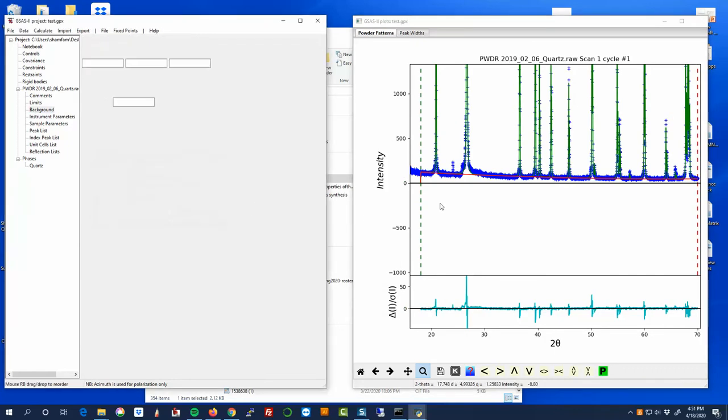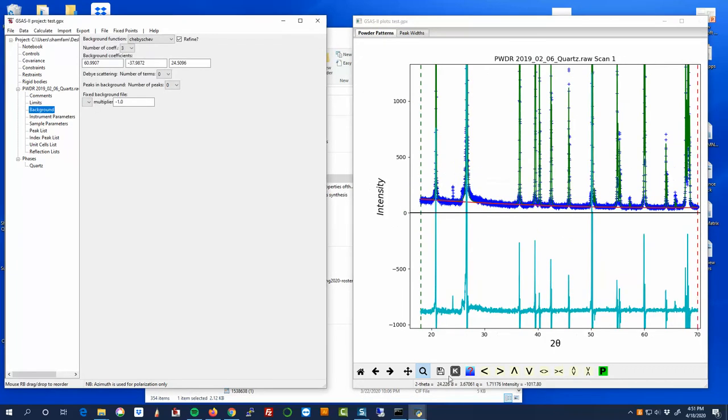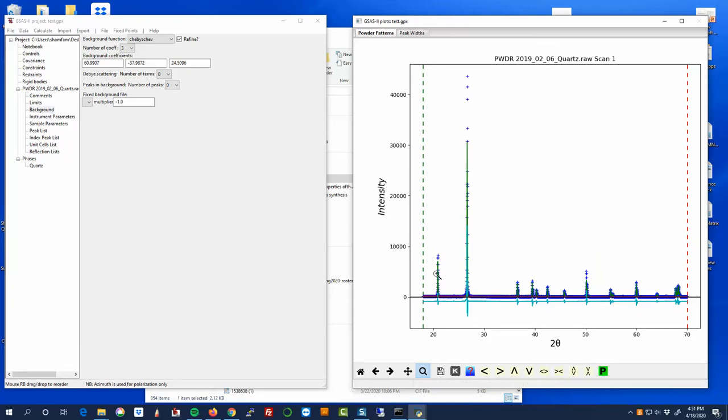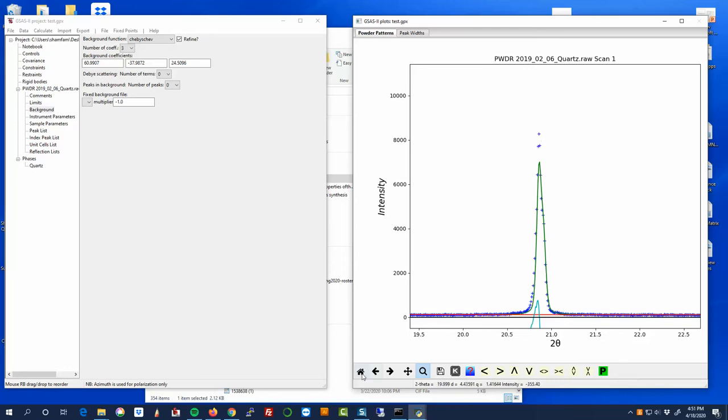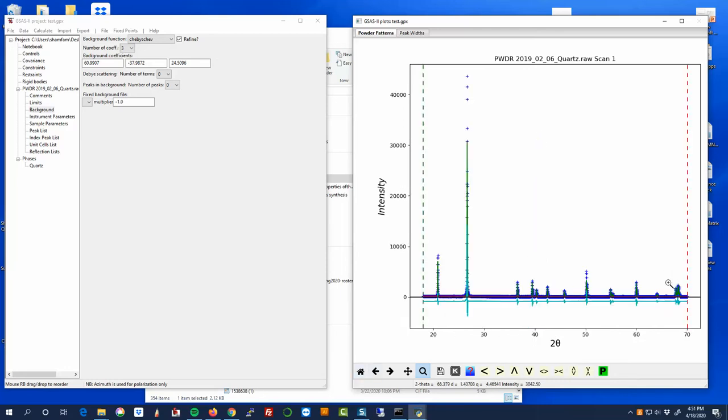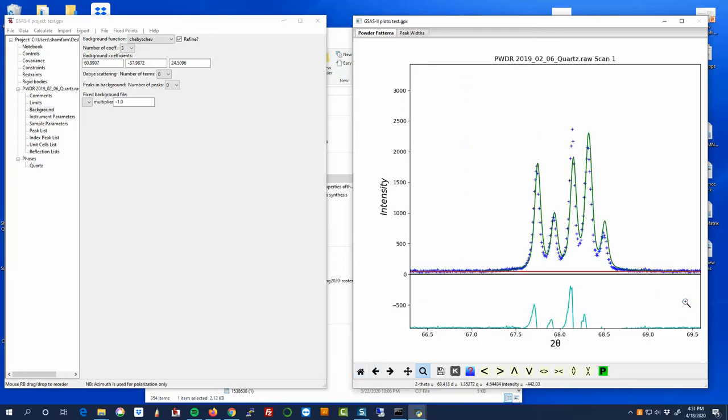And all of these, if I zoom back out, we can see it actually did a fairly good job at the very first guess. So again, the blue data points are our observed data. That green curve is the model. And the model is already pretty darn close to the observed data. So that's good. So that was a low angle peak. We can look at a high angle peak too. And we'll talk about where to go from here.